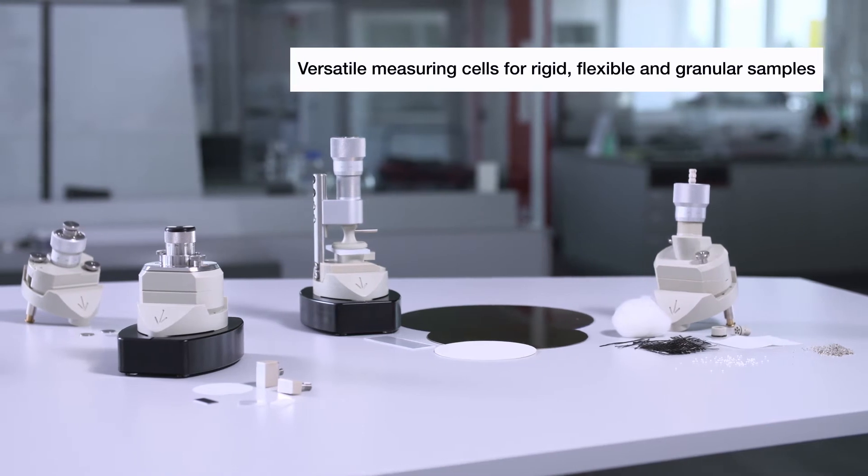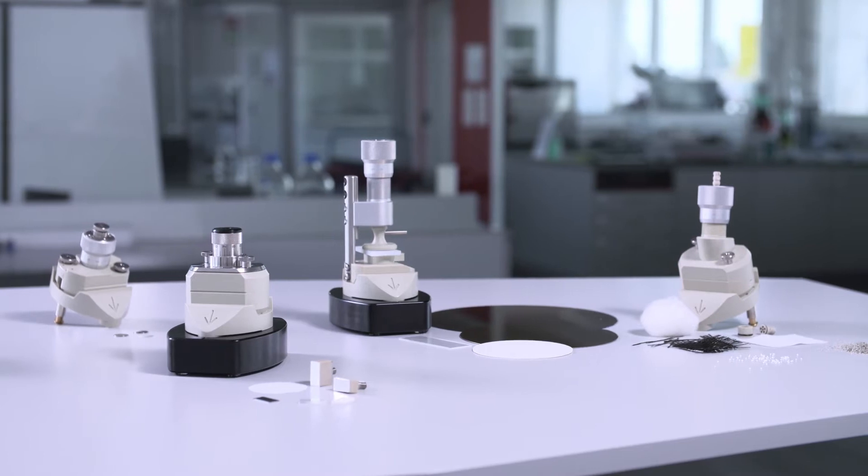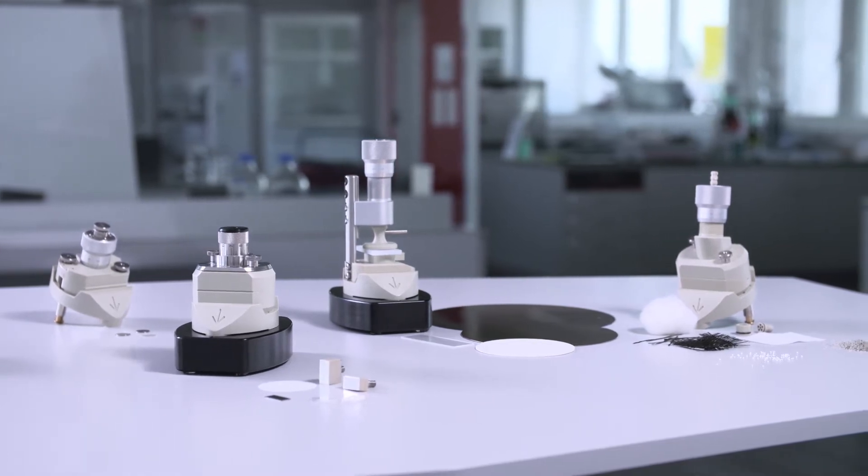The four most versatile measuring cells are suitable for porous and non-porous films, foils and plates, fibers, and granular and powder samples.